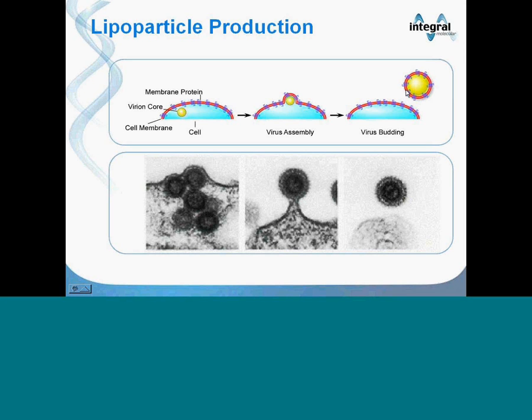It's a moderate amount. The lipoparticles are large, so it's a very slow process for them binding to the surface. So it's not a small volume, but it's not a huge volume. It's 50 to 100 microliters of a diluted solution of lipoparticles. And how would that be diluted?